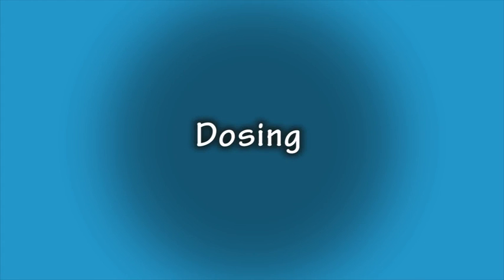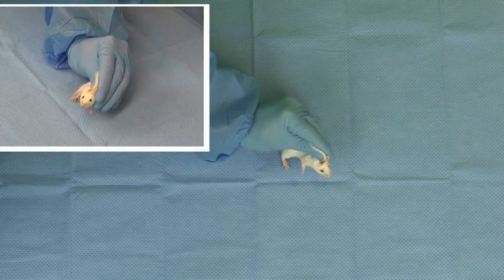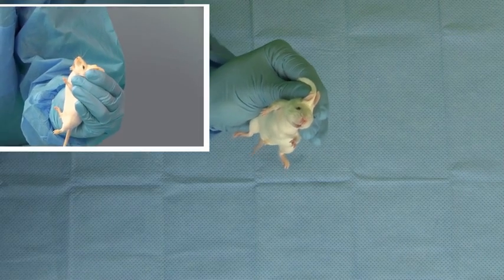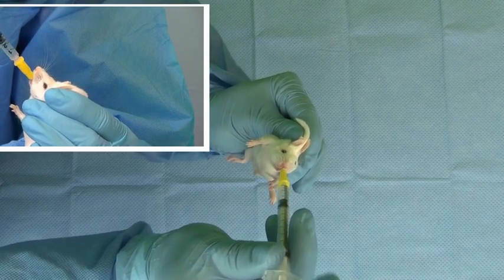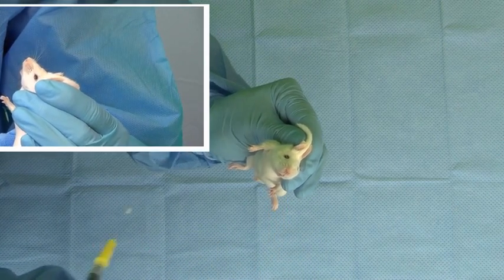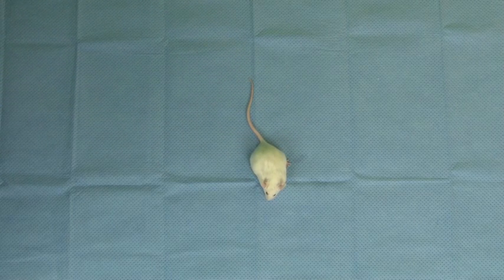Now let's look at the actual dosing procedure. The feeding tube should be inserted into the mouth to the right or left of midline. Entering from the side will reduce the chance that the mouse will bite the tube. Little to no resistance should be encountered, as resistance can be an indicator that the tube has entered the trachea. In addition, administration should stop immediately if fluid is noted bubbling from the nose, as this is an indicator of aspiration.